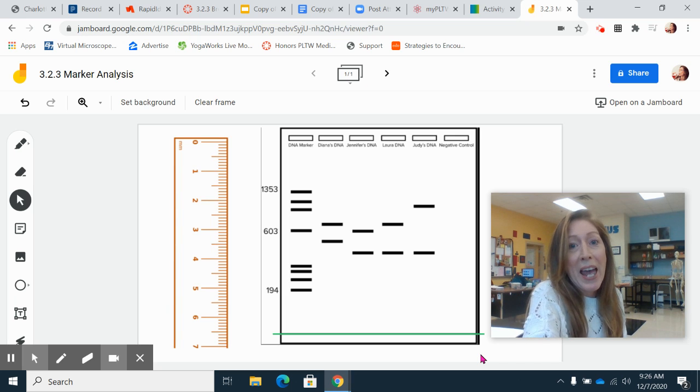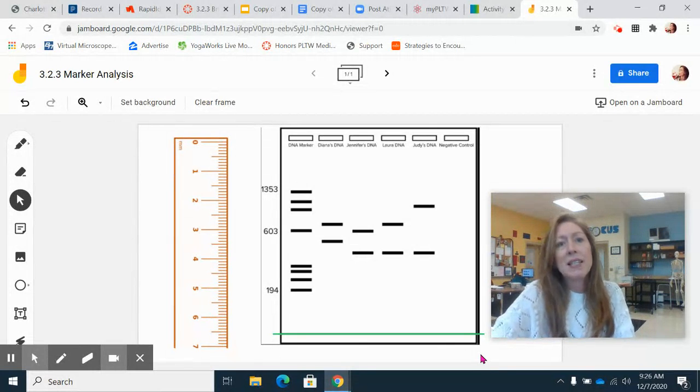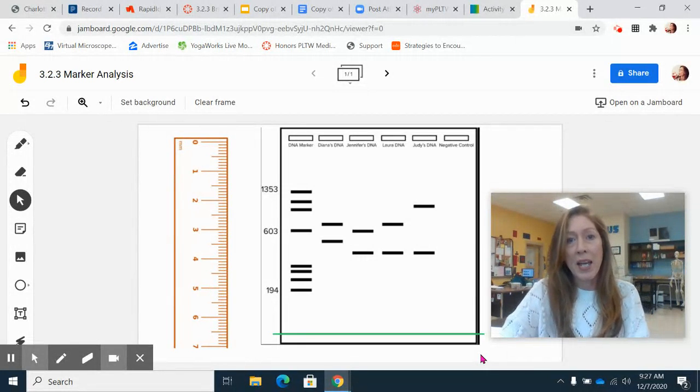Hi, we're going to look at Medical Interventions Lesson 3.2.3, and this is an instructional video on how to do the marker analysis. So we have tested Judy Smith and several of her family members for the presence of one of the markers for breast cancer, BRCA.